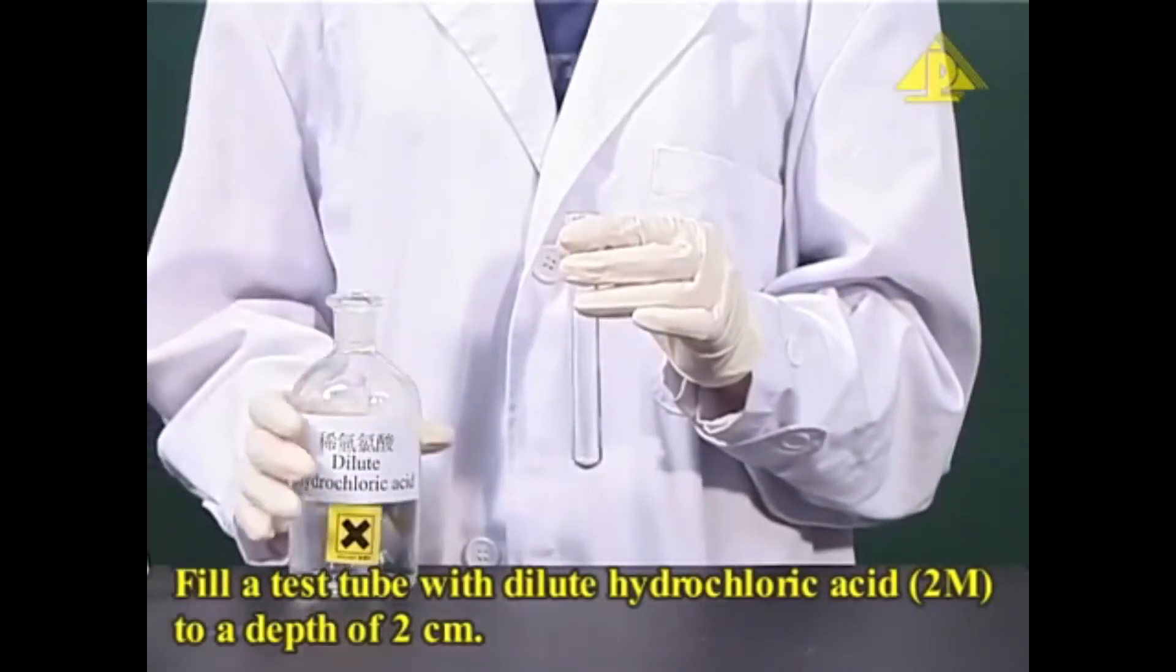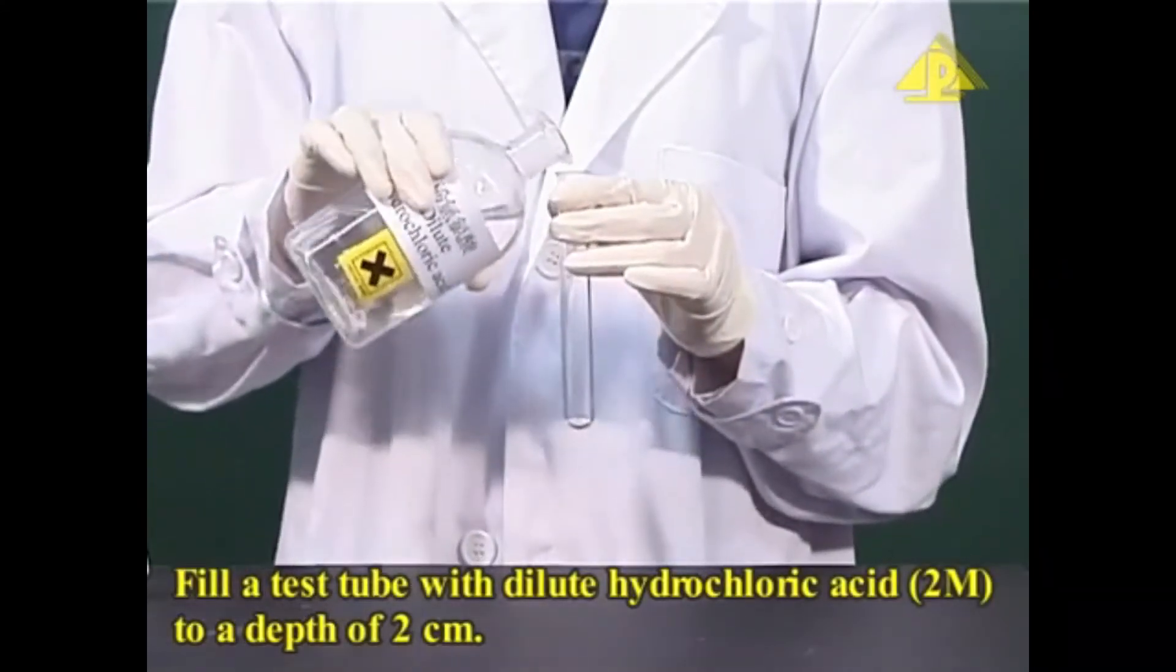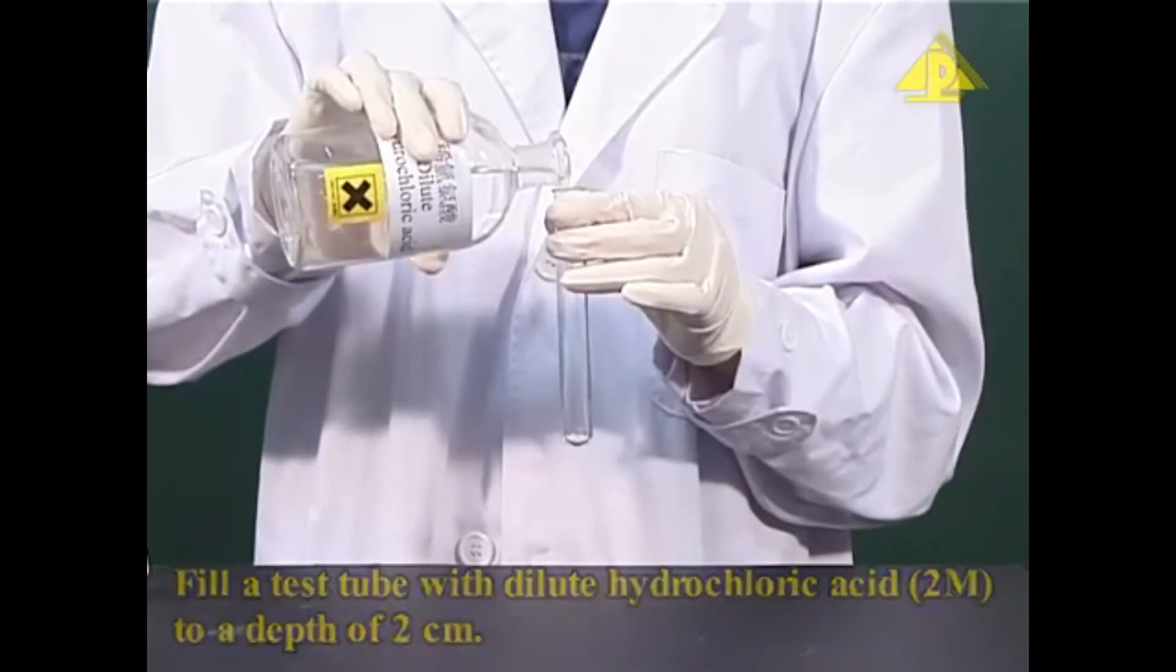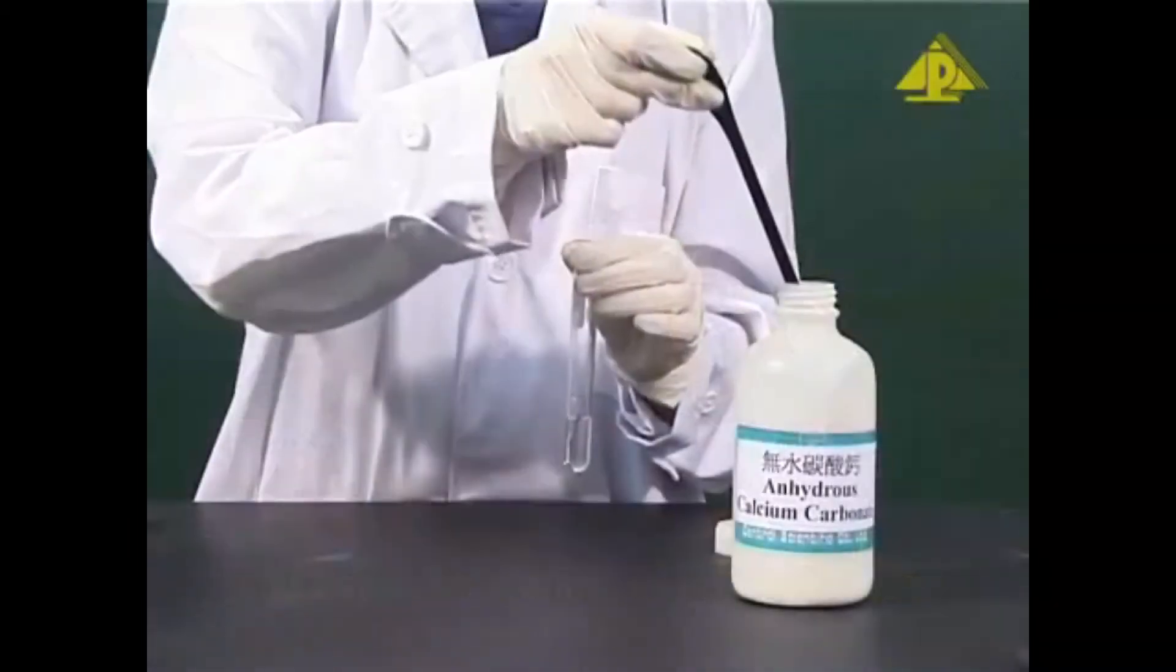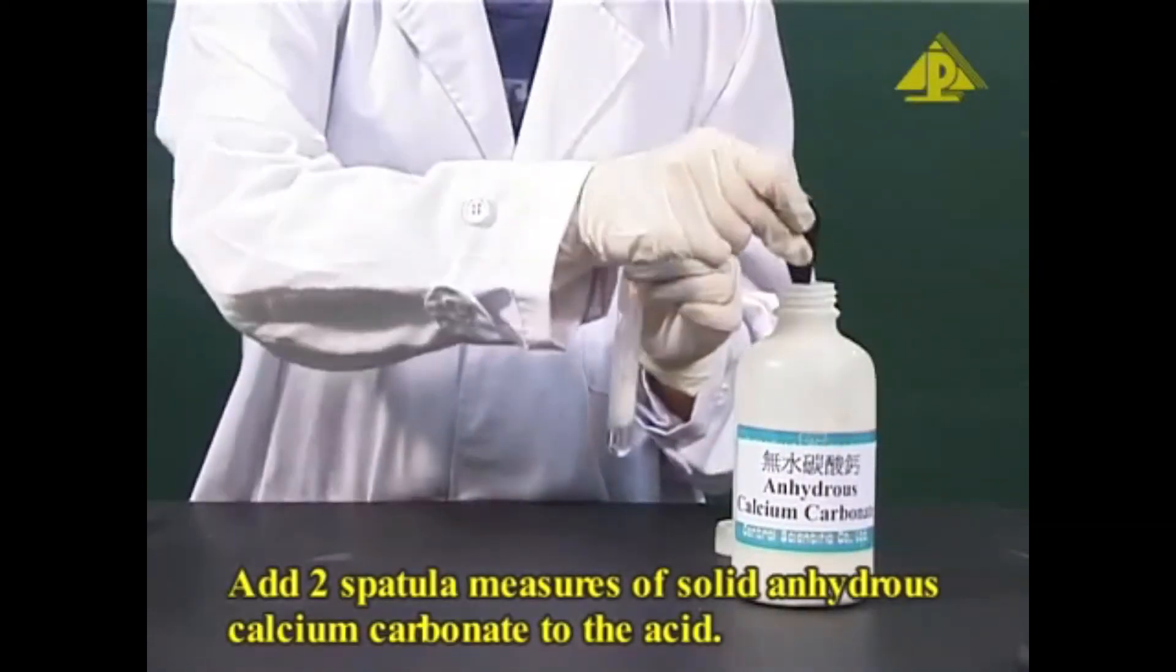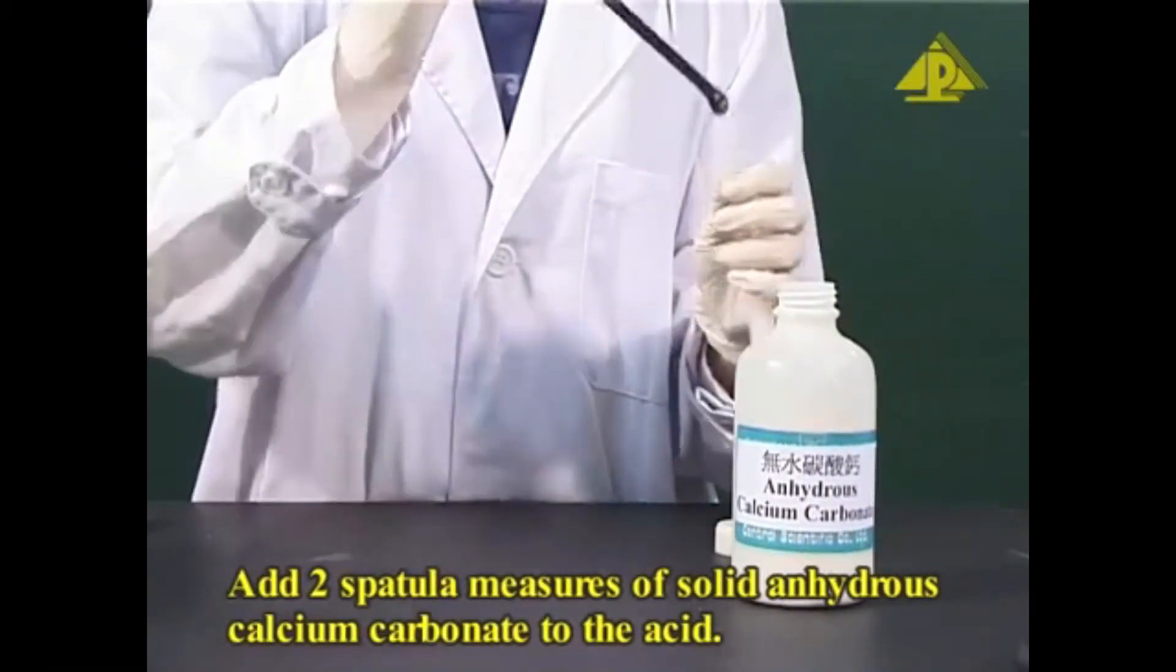Fill a test tube with dilute hydrochloric acid to a depth of 2 cm. Add two spatula measures of solid anhydrous calcium carbonate to the acid.